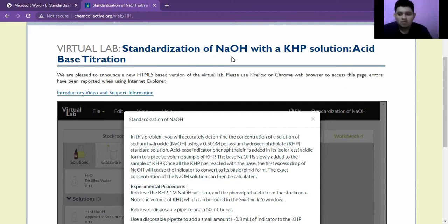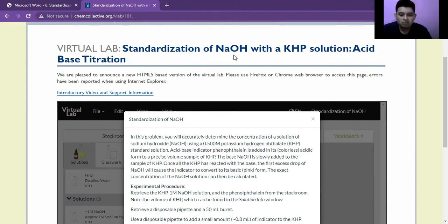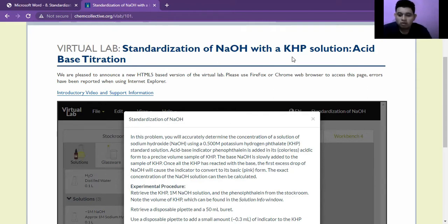Greetings, my name is Ernest Dongora, and today I am going to be presenting on a virtual lab standardization of sodium hydroxide, which we are going to be referring to as NaOH, with a potassium hydrogen phthalate, which we are going to be referring to as KHP solution, acid-base titration.